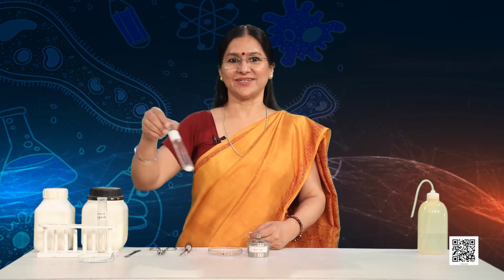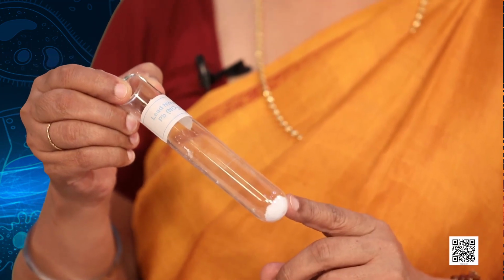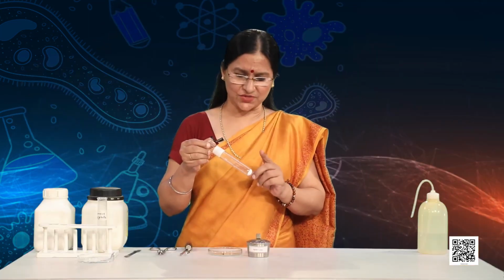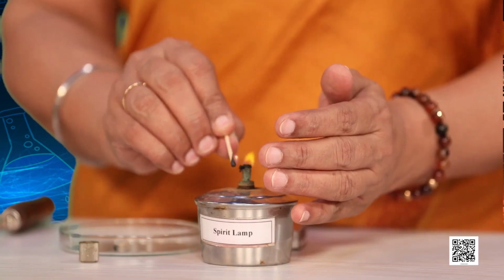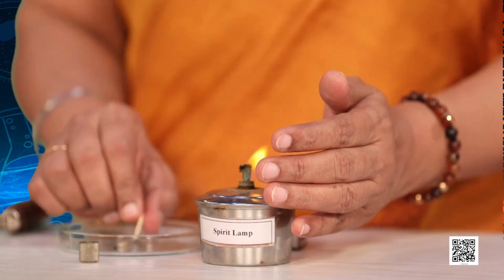To understand this better, let's do another activity. Here, I have lead nitrate powder in a boiling tube. As students of science, always remember to use chemicals judiciously, as they ultimately go into the drain and harm the environment. So here, I have just taken 2 grams of lead nitrate. Let me heat it over the flame. And here I am reminding you, never do this experiment on your own. You should always do it under the assistance and guidance of a teacher.